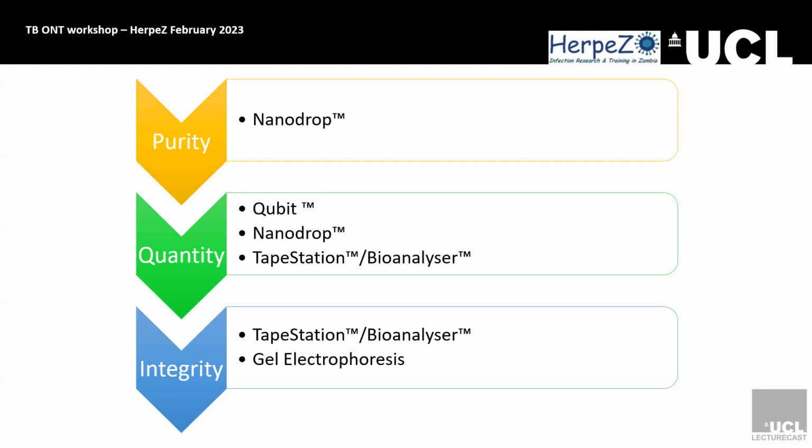But it's also really good for whole genomes, because it's got a high molecular weight option. It goes up to 60 kb, which with the nanopore, not necessarily. It's really important that you have high molecular weight. The higher the weight, the longer your strands are, and for nanopore that's really, really important. You can do this on gel electrophoresis. It's just going to take a bit longer, and you have to have a ladder that in theory should be able to reach the whole way. We bought a special long ladder, so hopefully it works because I've not used it yet.